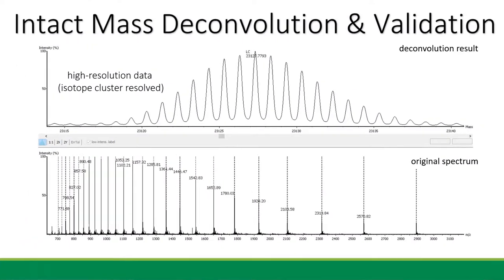Lastly, a new module of intact mass analysis is included. Here we are looking at an antibody protein light chain intact mass data at the bottom and the deconvolution results on top. This data was acquired with high resolution. Therefore, you can see the resolved isotope clusters.